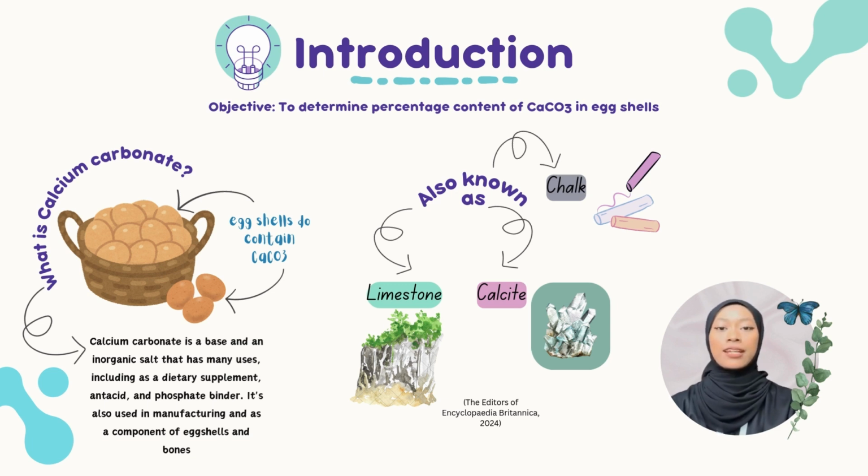Do you know that eggshells contain calcium carbonate, which makes the eggshells have a hard surface? Well, calcium carbonate is a base and an inorganic salt that is widely used in dietary supplements, antacids, and as a phosphate binder in manufacturing. Calcium carbonate is also known as calcite, chalk, and limestone. These examples are common to contain a high percentage of calcium carbonate.